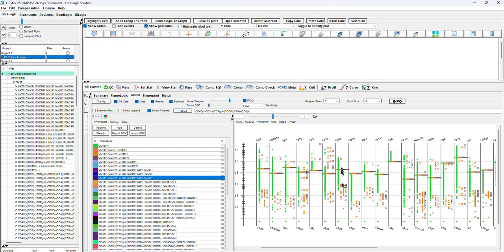And here is clear. For example, have a look, CD28. Now we are using low sensitivity, but we can have very high sensitivity, which is taking care of data in a different way. So the comparison is more stringent. But for the purpose of this experiment, we show the data as it is. So file 1, CD28 positive, file 2, and this is what doesn't match with file 1.